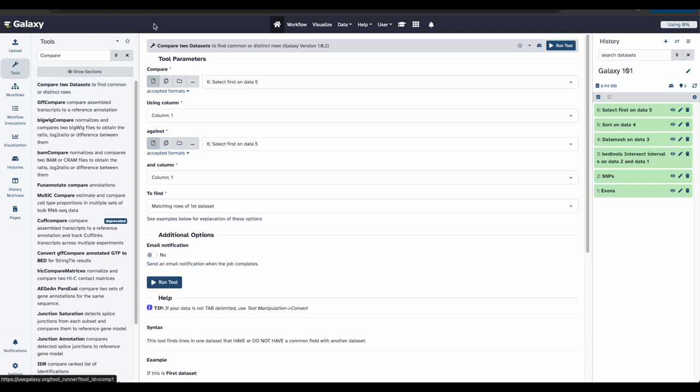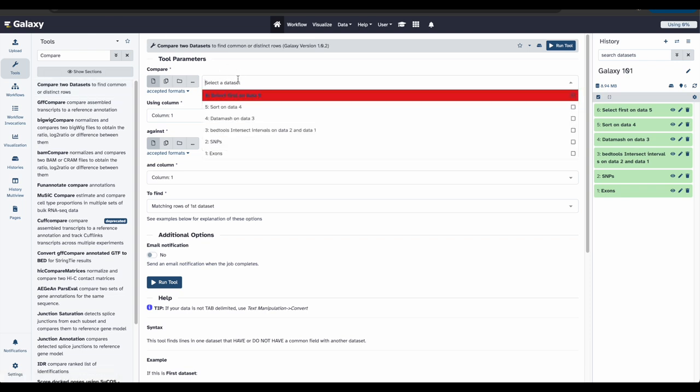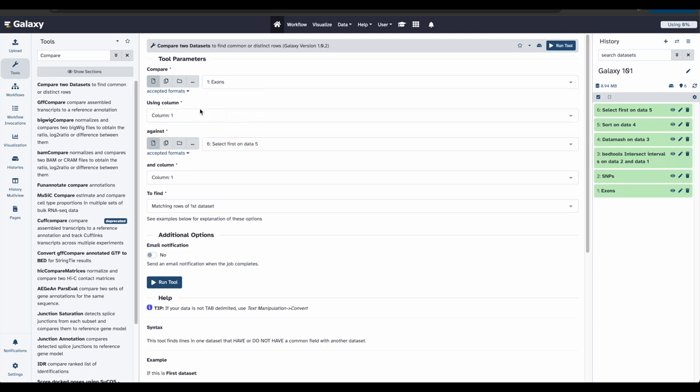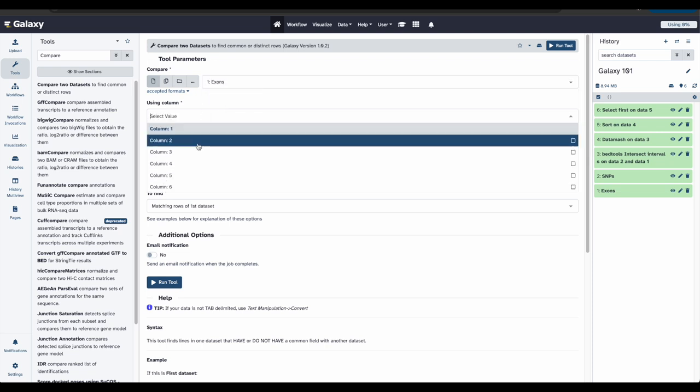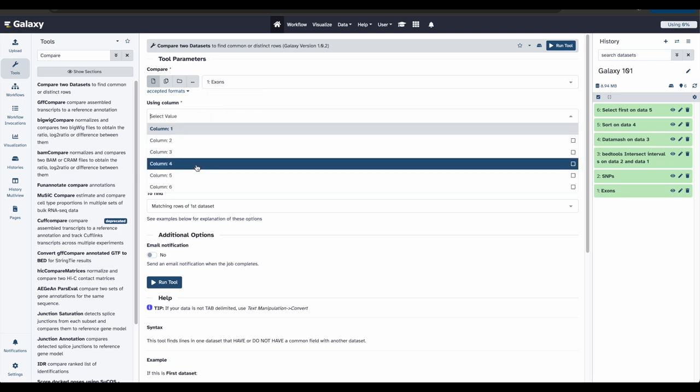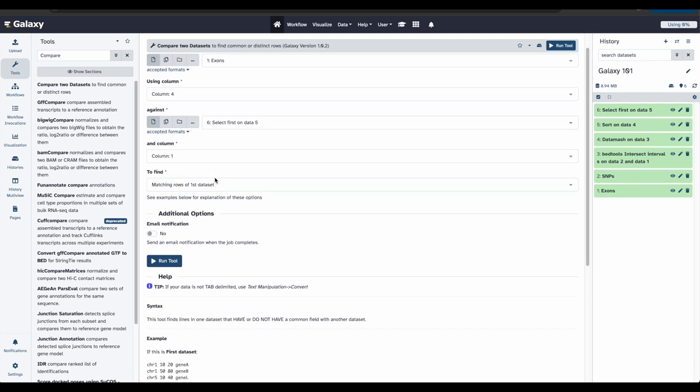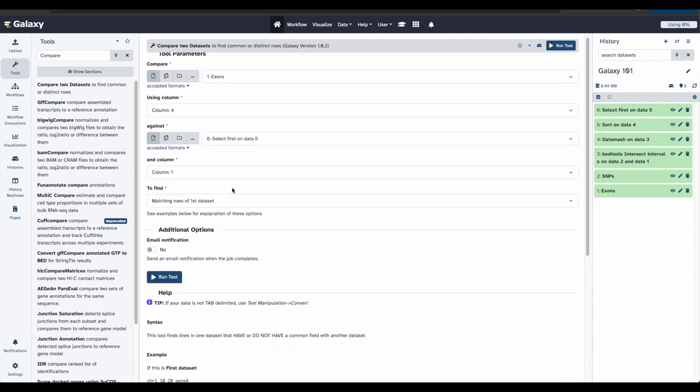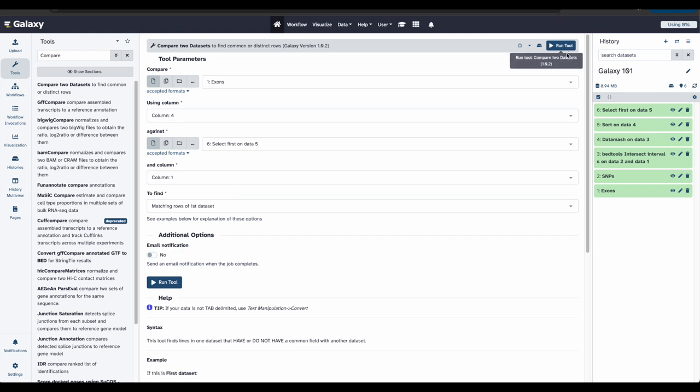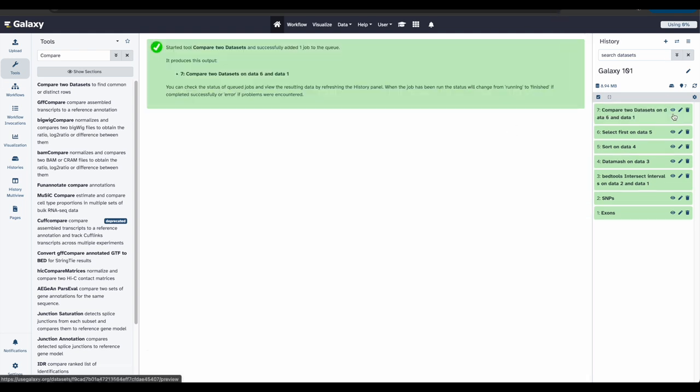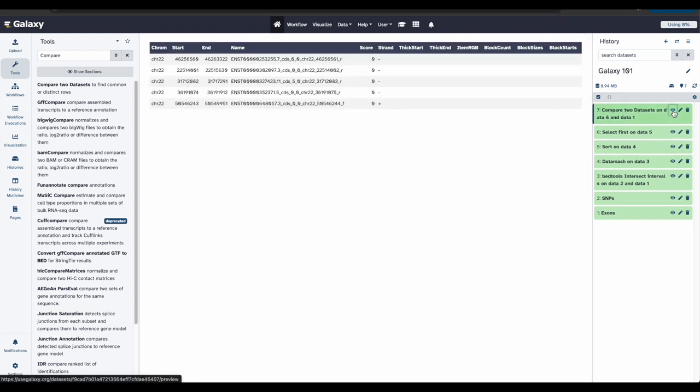We will compare the original exon file using column four against the output from our select first tool that we just ran. And we are going to do that column one and find matching rows on the first data sets. Click run tool. And let's take a look at the results. Awesome. Now we can see the locations of the top five exons have been added back into our data file.